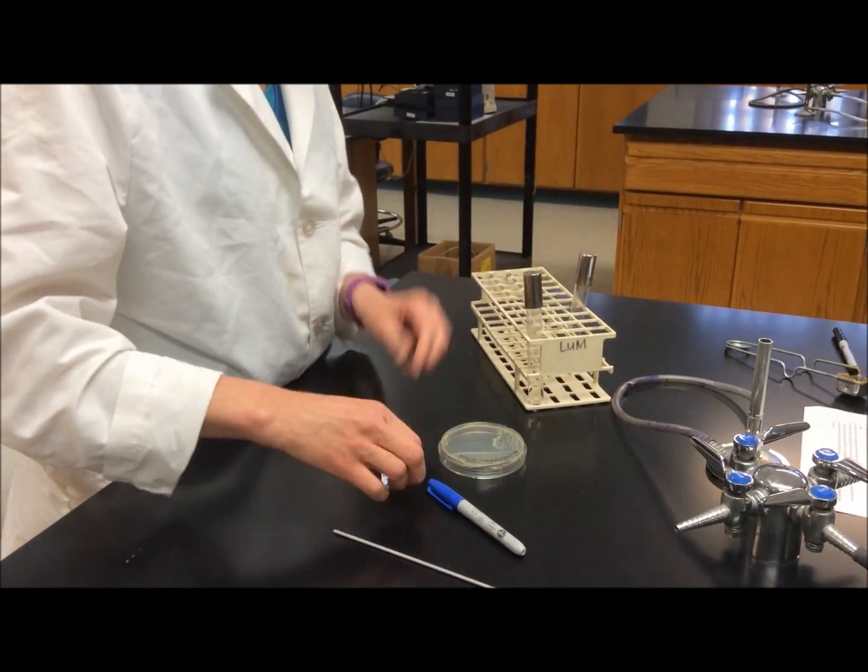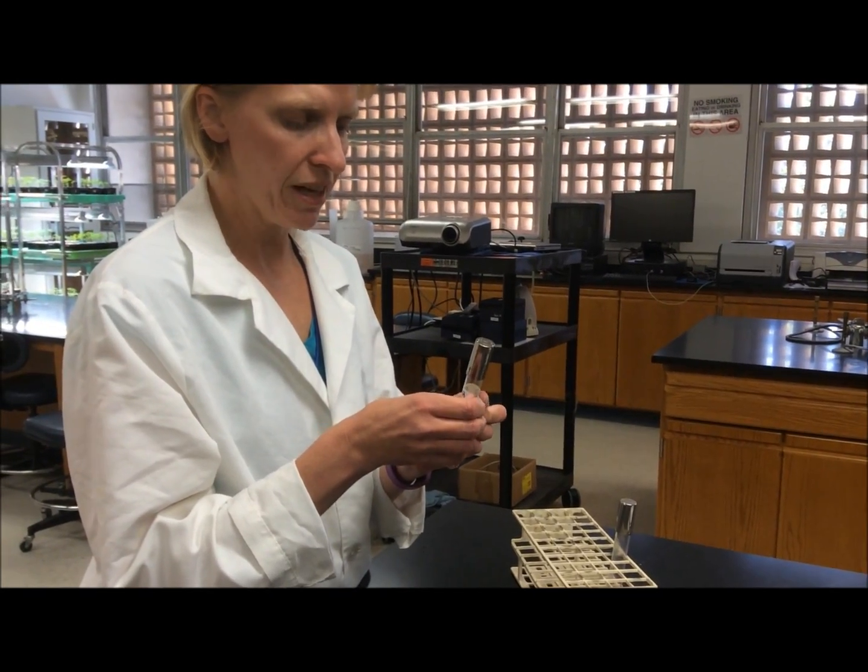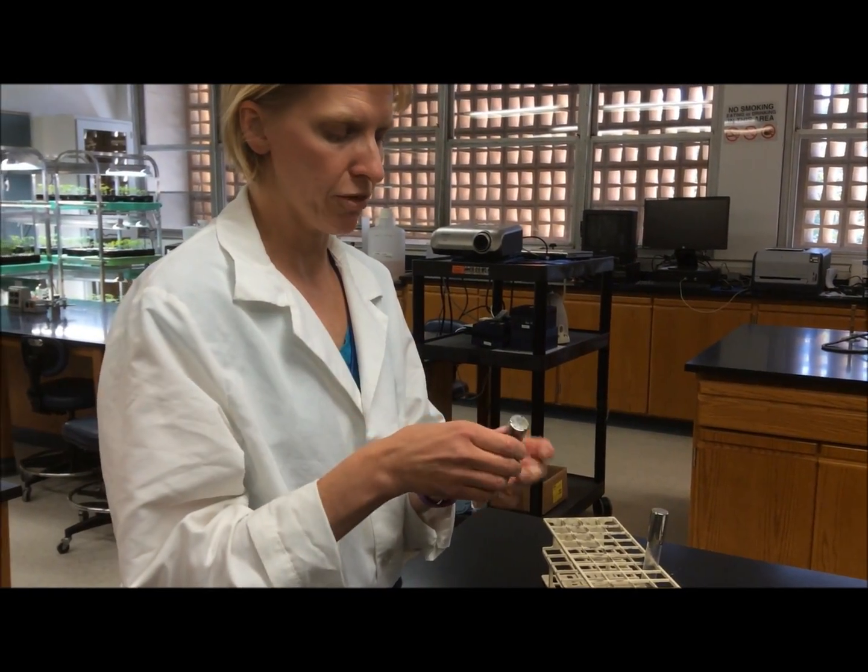It's very important that when you apply the label to your culture, you apply it to the tube itself, because the cap could get separated from the tube.